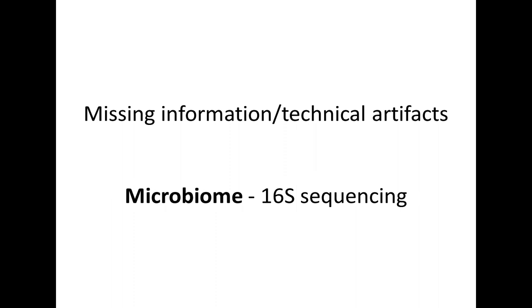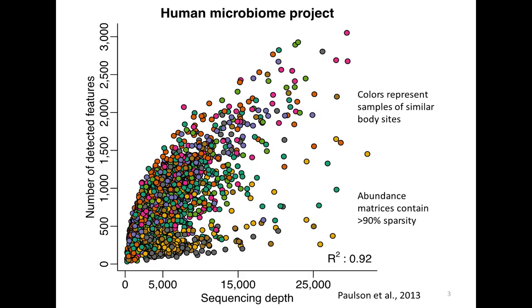But the majority of the talk today is going to focus on the microbiome, and in particular on 16S sequencing. I'm going to highlight several old papers now, and try to tease the audience with some more recent developments that I'm happy to answer questions about or present in the future. So one more time, everything is about what's missing.